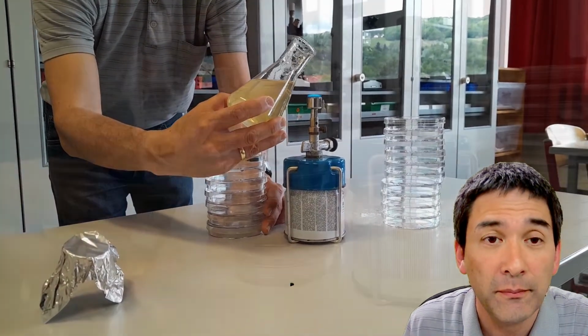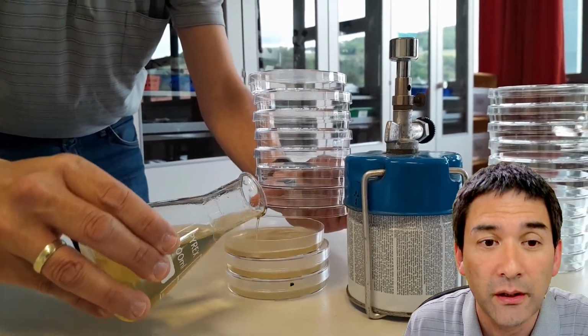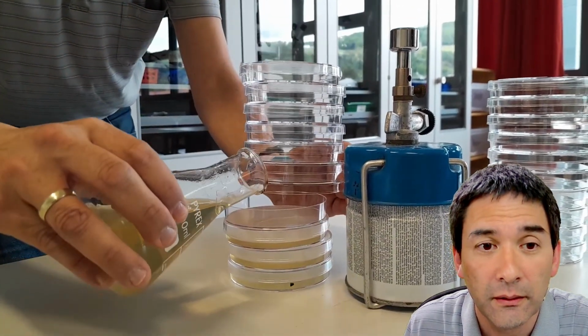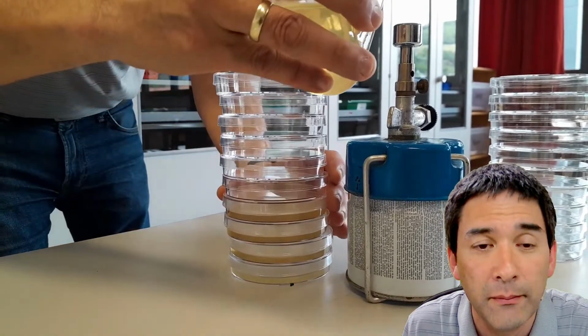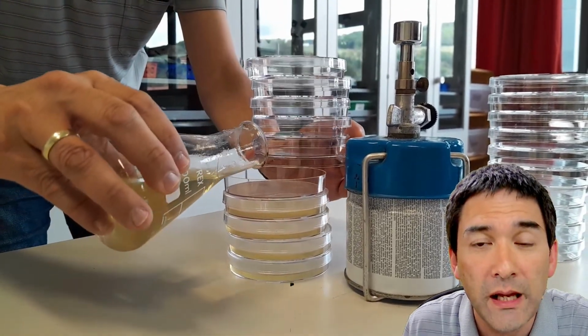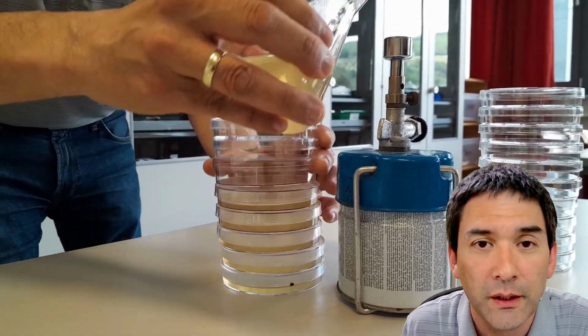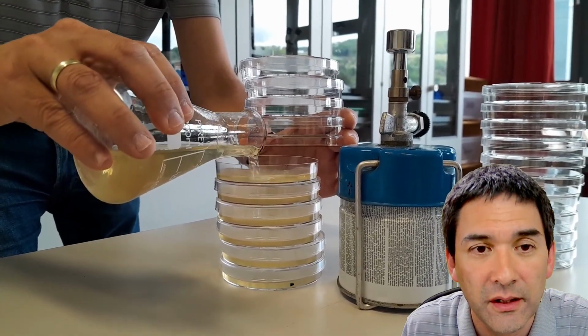Now I'm pouring it out. The agar nutrient medium is still warm, and I am basically pouring it out. Then I have to wait for some time for the agar medium to turn solid at room temperature. This does require a pretty steady hand and patience.